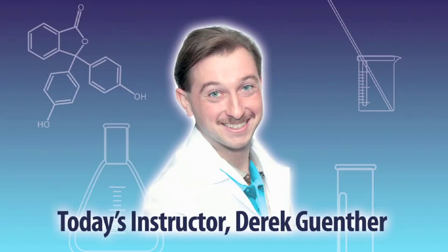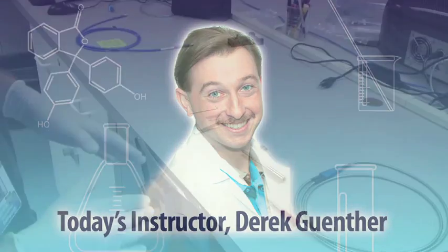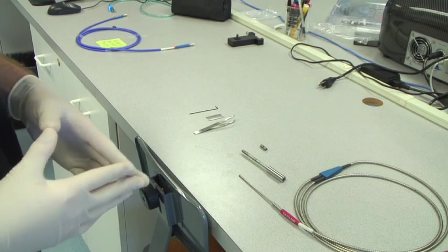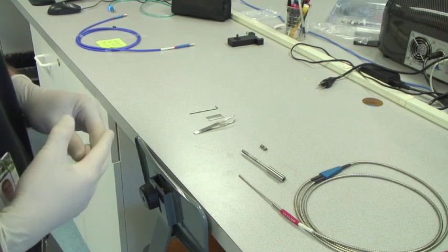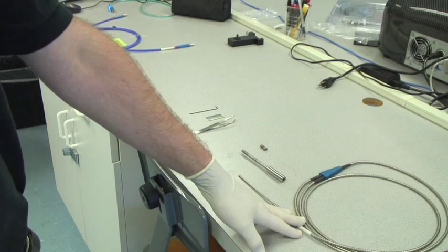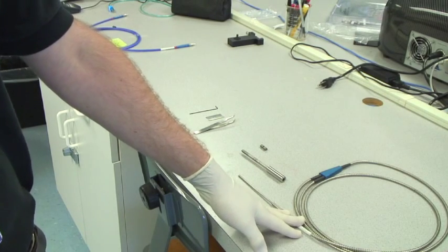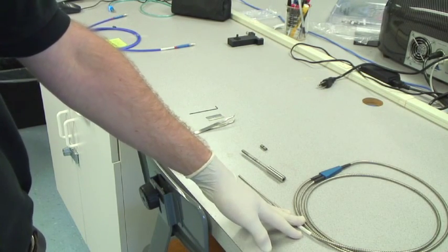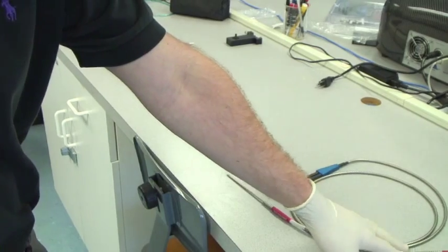These are all the components you'll need for the assembly of the T300 transmissive pH dip probe. We have the fiber ferrule here - this is the RE Bifboro randomized bundle with the two fiber legs for the spectrometer and the light source.